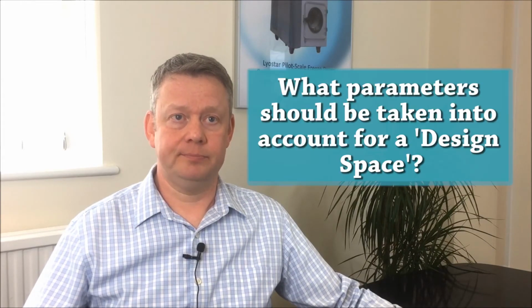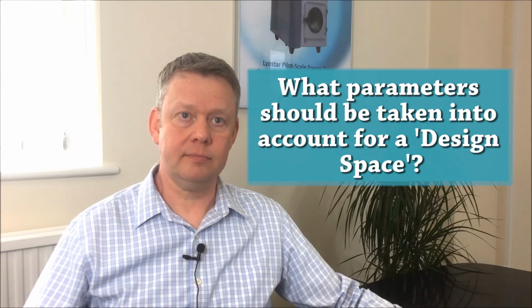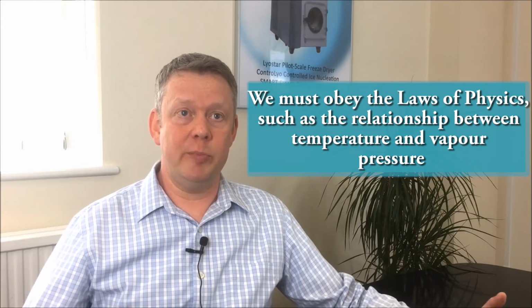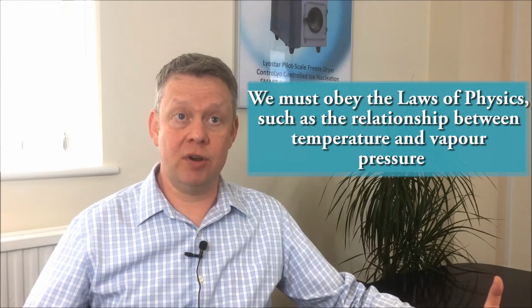Okay, so talking again about the design space, what parameters should you or absolutely have to take into account for freeze drying, seeing as it is quite a complicated process? So I guess the thing that we all have to obey is the laws of physics. So there will be a temperature pressure relationship that you'll have to obey in the freeze dryer.